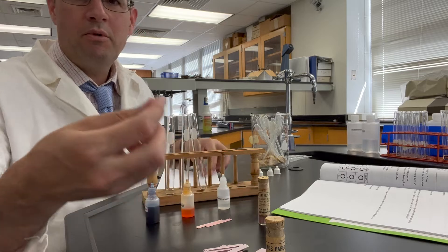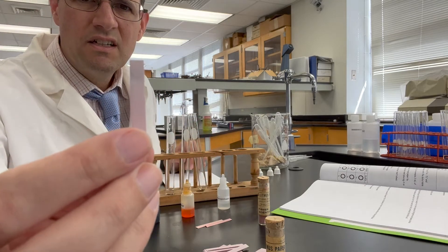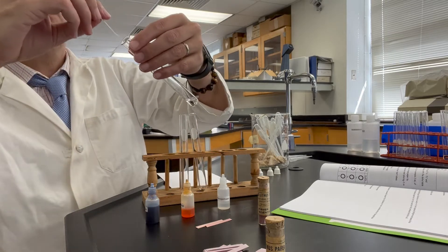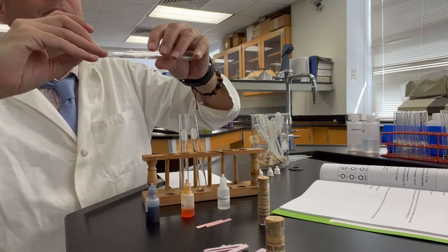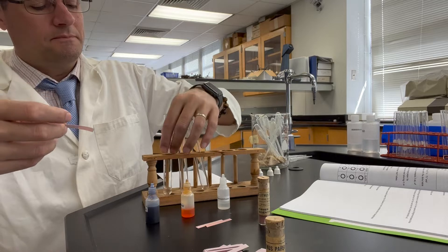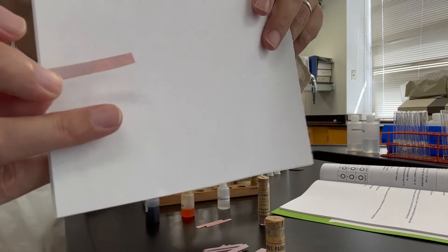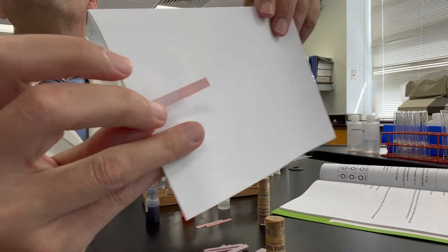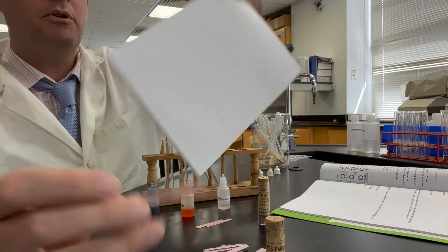Now the blue litmus paper — remember it has a little bluish tint to it. We're going to place this into the hydrochloric acid, which is 0.01 molar. That's the color of the litmus paper in 0.01 molar hydrochloric acid — hopefully you can see the tip of the wetted litmus paper.